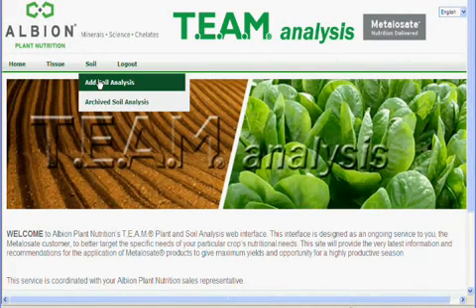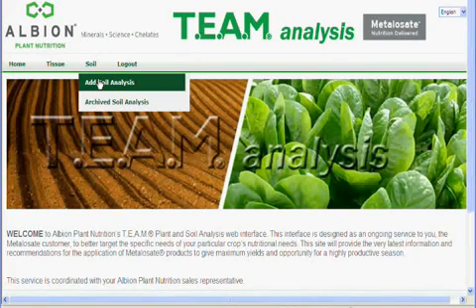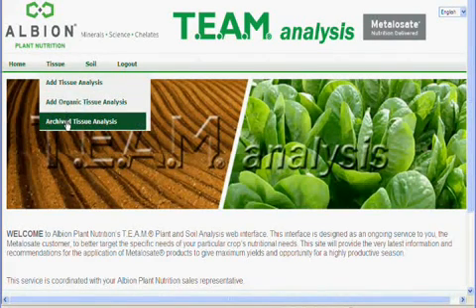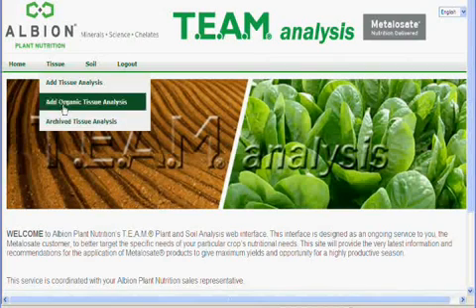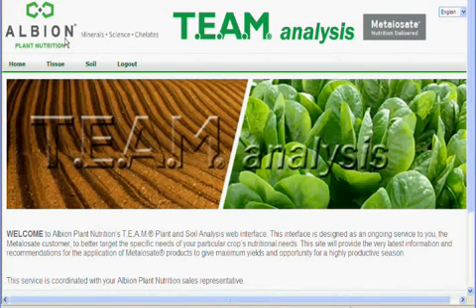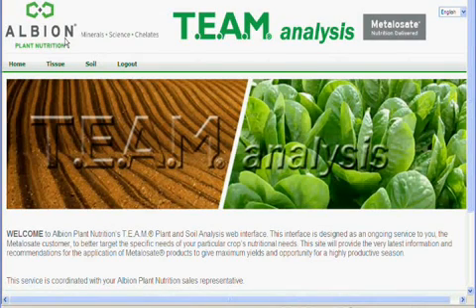In addition, you can look at archived recommendations for all three types of analyses, and they are available through the same menus here and here. Analysis for organic tissue recommendations and soil recommendations are similar in nature, so we will not be demonstrating data entry for those areas.